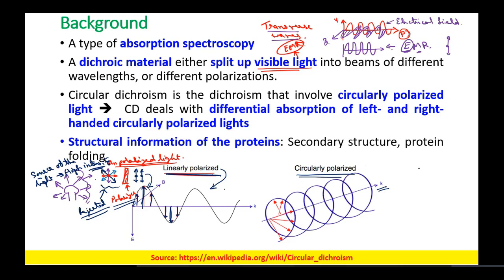However, over here, when we talk about this movement, it is moving in a helical pattern. It is taking a helical path.